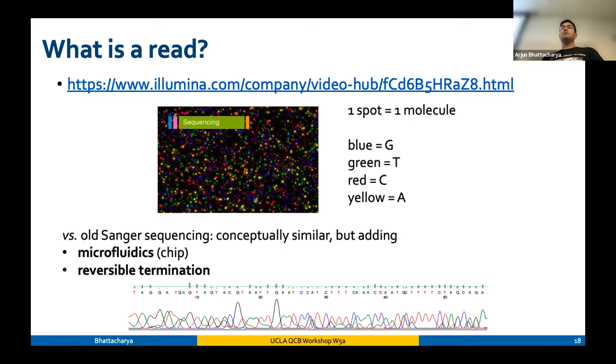One thing to always note is that the cDNA library doesn't have the same number of millions of reads that your raw RNA data does. There's an amplification step. You do your reverse transcription and get your cDNA library that's pre-selected for the different RNAs you want to sequence. Then the first step in any RNA sequencing machine is a PCR amplification. It takes reads that are very similar to one another, sorts them into different pockets and runs amplification steps that generate forests of similar fragments. That gives you relative abundances and makes it much easier to build up the sequences.